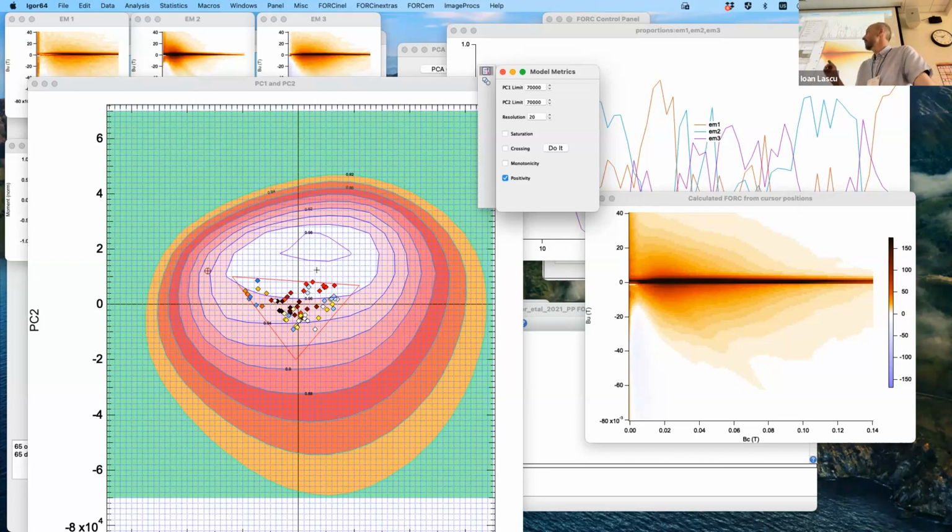And we went to the positivity just because the 0.99 contour was so large that it seems maybe this contour over here will tell you that if you go past this, they become physically unrealistic. So this one kind of helps. I'm just suggesting you try it out once and see what happens. It gives you some reference.